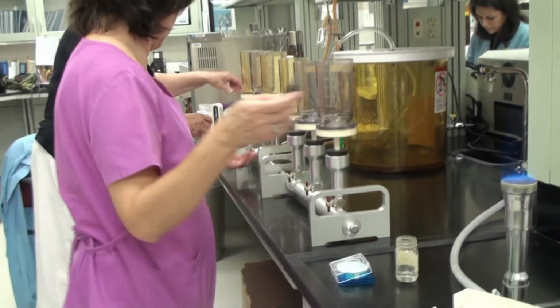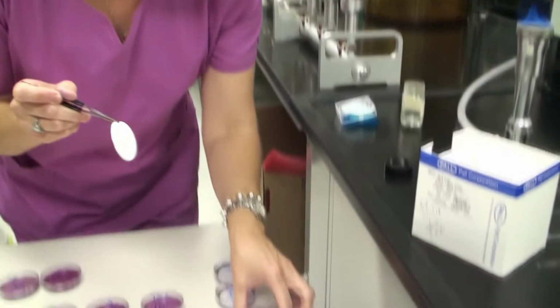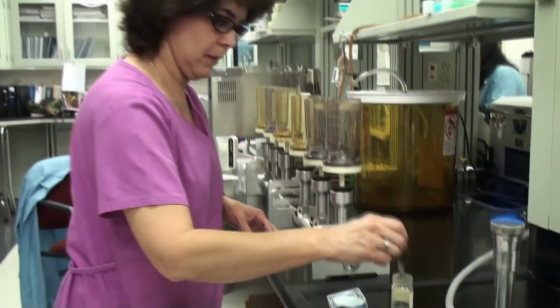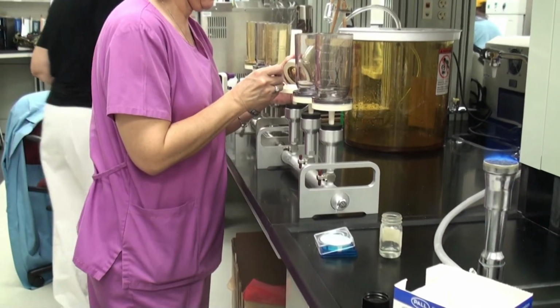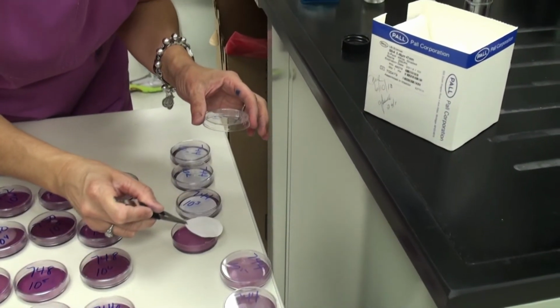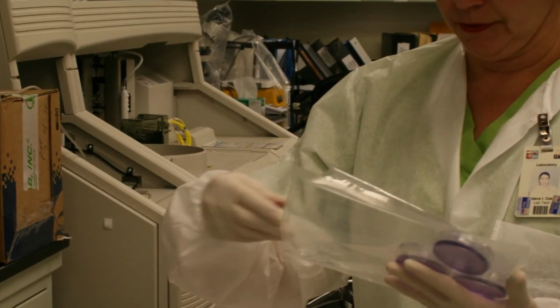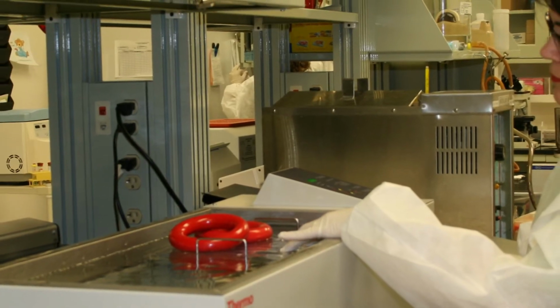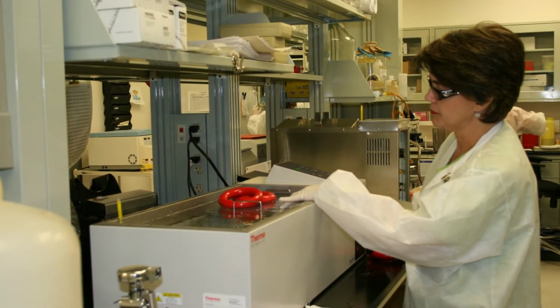Bacteria levels in some parts of the Rio Grande are so high that the only way to get a count is to dilute the sample. Each membrane has a known concentration of the diluted sample filtered through it. Any fecal coliform bacteria that existed in the filtered sample remain on the membrane, which is then placed in a petri dish with media. The petri dishes are sealed in a bag and then placed in a water bath to be incubated at 45 degrees Celsius for 24 hours.